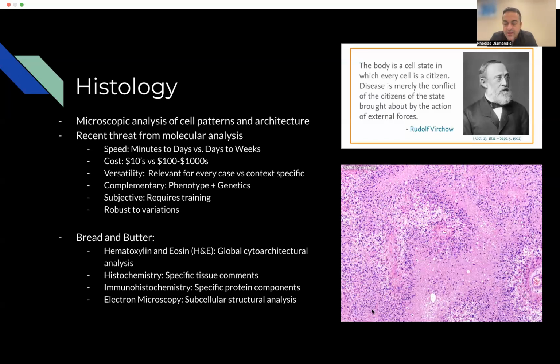And so here we see an example of this. This is a tumor. This is a glioblastoma. Even in this tumor, we see disorganized glial cells. So we know that there is a tumor, but the amount of layers that you can make out is exceptional.